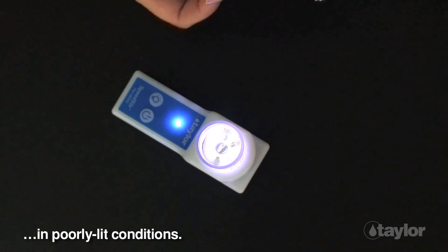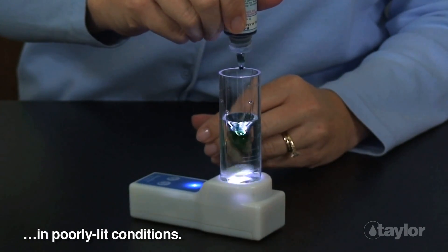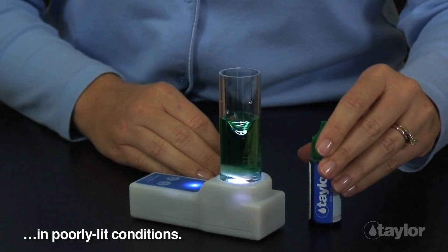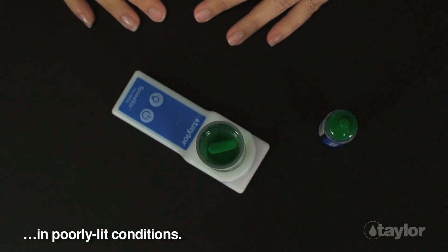The Speedster runs on four AA alkaline batteries at 600 revolutions per minute. Made of high-impact polystyrene, it is water-resistant. You can spill water on it, but you should not submerge it. Wipe off any stains promptly.